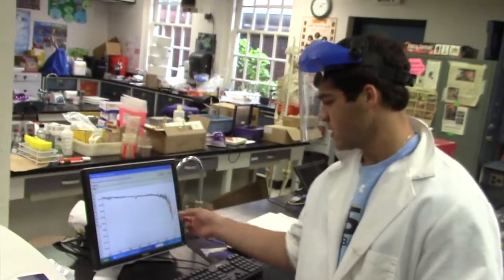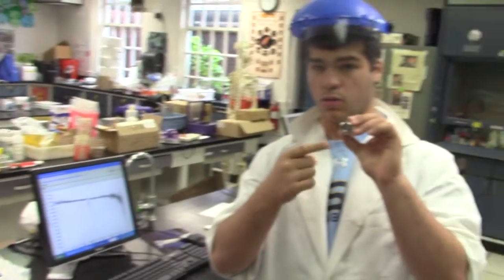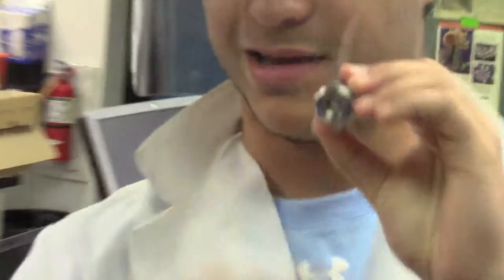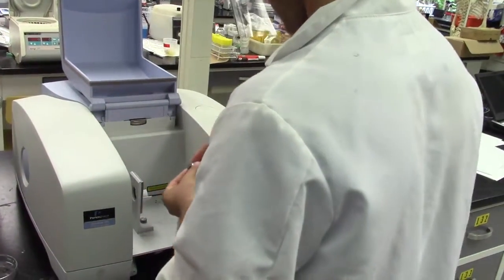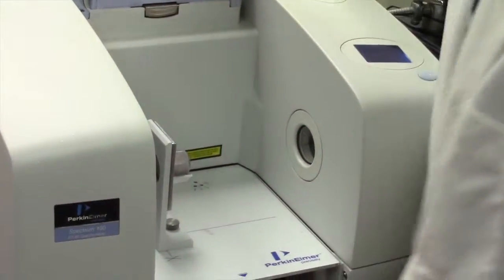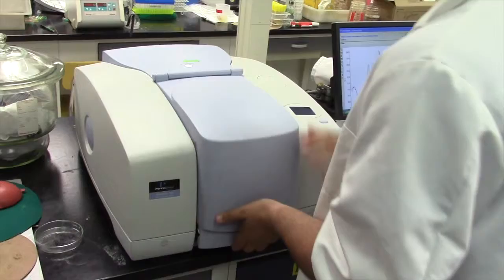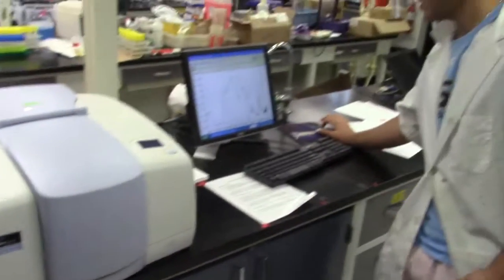And now that our background scan is complete, you will place the whole thing with your salt plate in it into the IR. And then you click scan again.